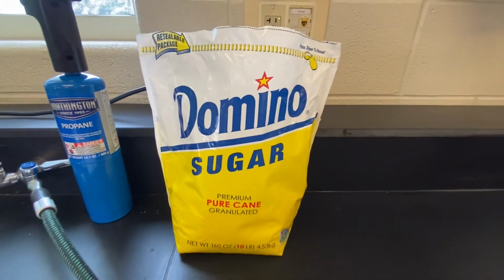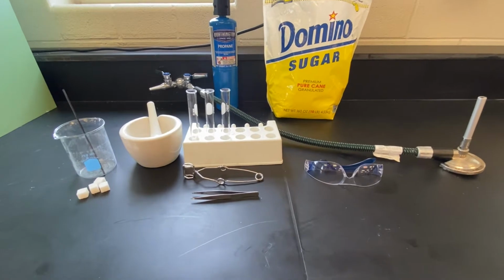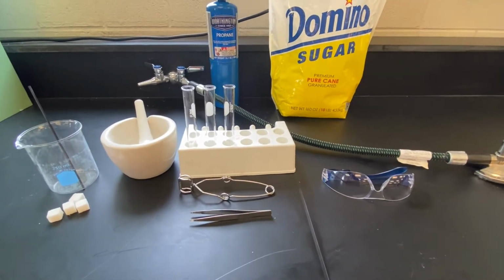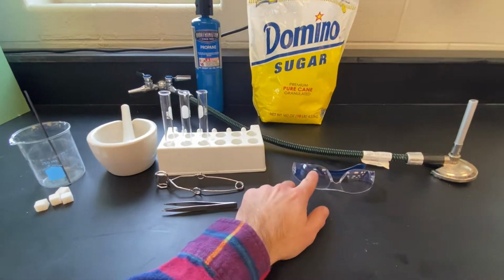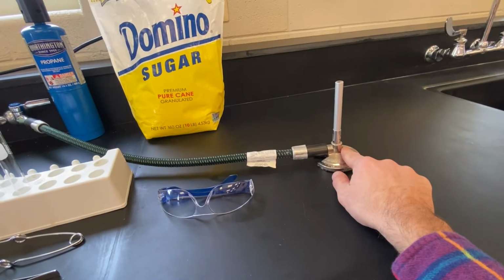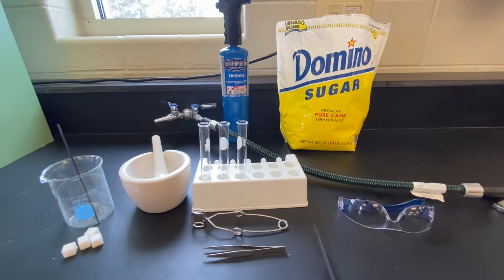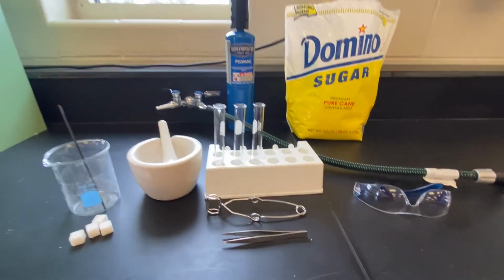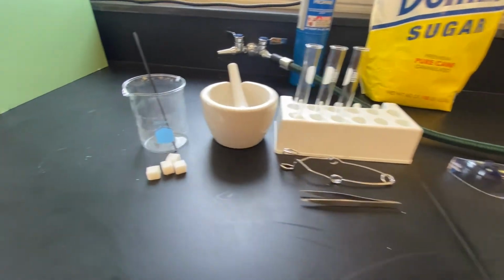Okay, so you can see that I have a little lab set up here with various materials that we're going to be using, some of which we'll use for the lab itself, some of which are just for safety, like these goggles, which will come in handy when I use this guy over here, which is a Bunsen burner, which follows this hose up to the wall and is connected to a gas jet that distributes natural gas once I turn that on.